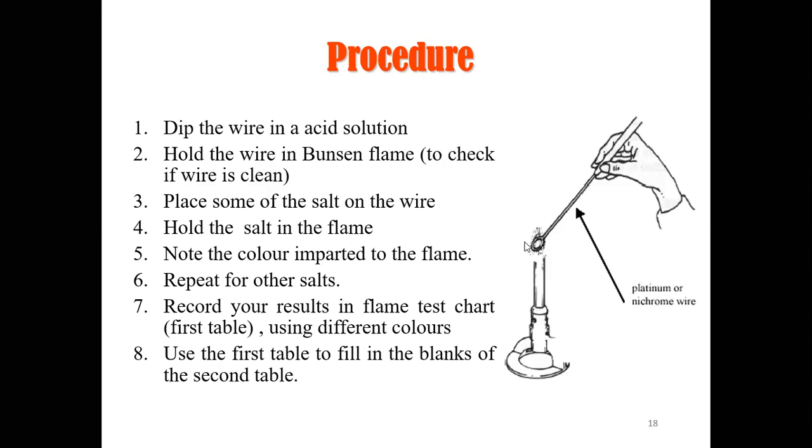You can also ask one question: if we want to make the solution, why are we not using water? Because water is the best solvent. Water is the universal solvent. It has the ability to dissolve most compounds. Yes, that is true. But at the same time, there are some compounds which will not dissolve in water. To avoid that restriction, we are using dilute hydrochloric acid, which will dissolve all the analytes or compounds that we are planning to identify. That's why we are using hydrochloric acid.